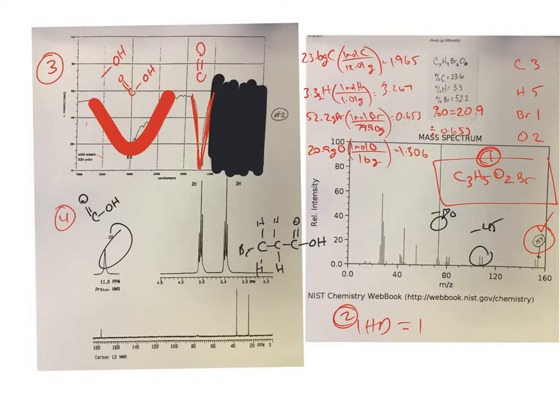And then that spike at 1,700 to 1,750 for your carbonyl group. Those are just the easiest peaks to spot right away. And they tell you so much about a molecule if it has or does not have those. Between that and knowing your molecular formula, you're partway there, really. And then beyond that, the rest of the data in your IR, while you can find other useful data, it's just harder to find. So come back to it later. You might not need it, right? So just be cognizant of how much effort you're putting in and what the payoff is.